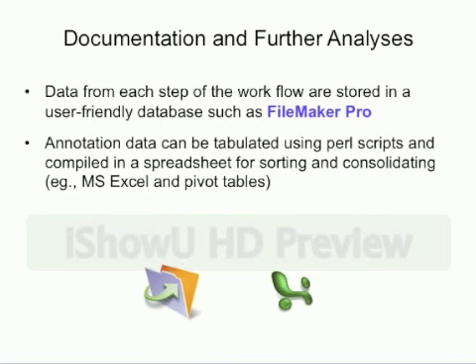After all that analysis and workflow, what do you do with your data? You have to store it in a readily accessible form. We used FileMaker Pro, a database program that you can configure really easily, just by drag and drop. If you can make boxes and tick marks on a PowerPoint presentation, you can use this program. We use it to store our annotation data, all the expression data and Illumina sequence alignments. And you can also use this database to search or mine what you want to see.